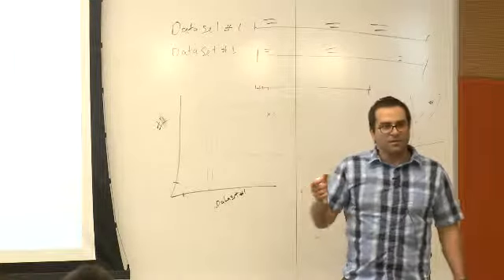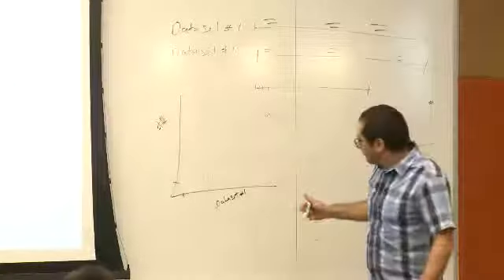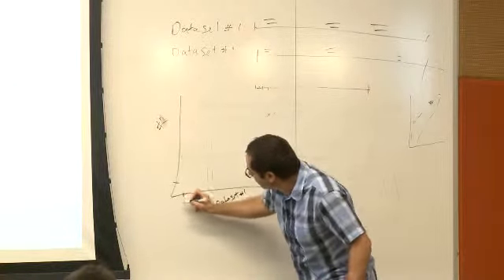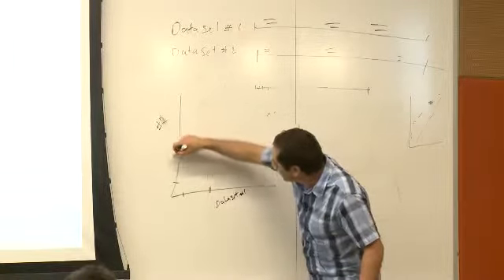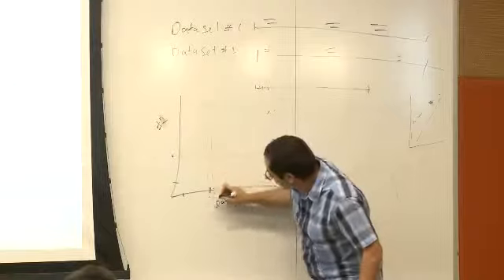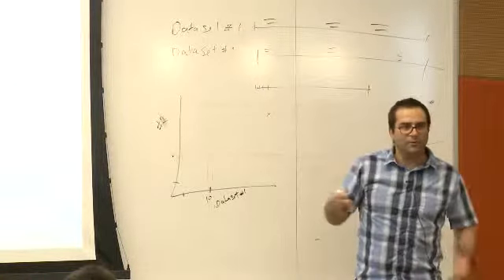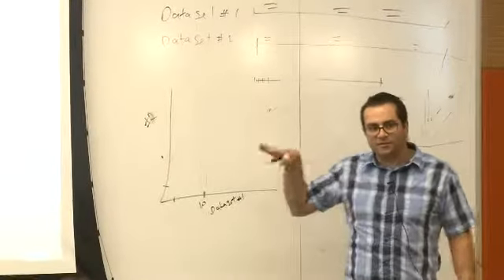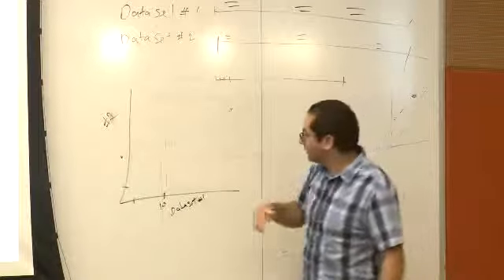Let's say that when we take fragments of 5 kb, we're going to have fragments of 5 kb that have almost nothing. And then we're going to have fragments of 5 kb that have more in both of them. So this will be, let's say, 10 reads per 5 kb, or an average of 100 reads per 5 kb, or so on. We also do some normalization for 20 million reads in it, but I don't want to get too complex.